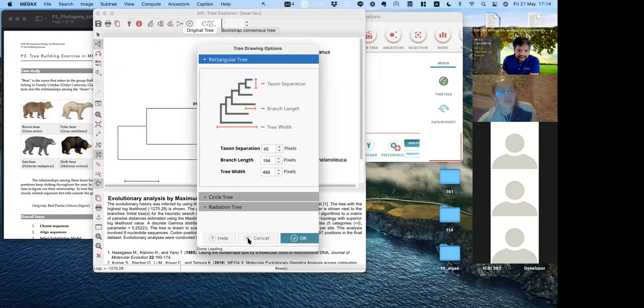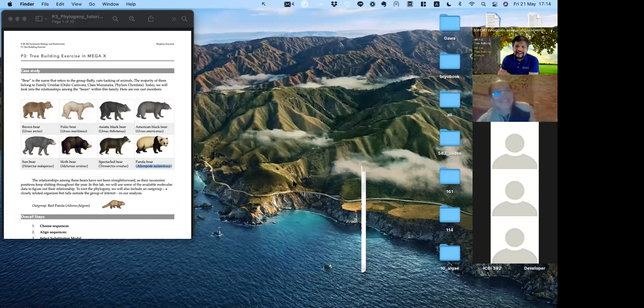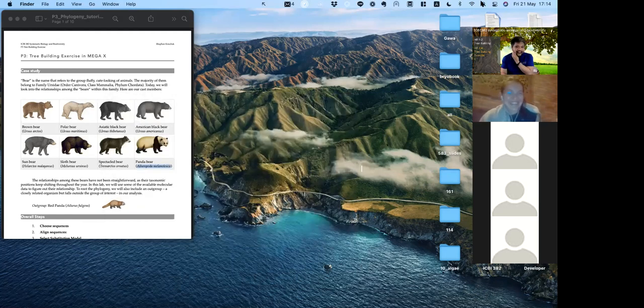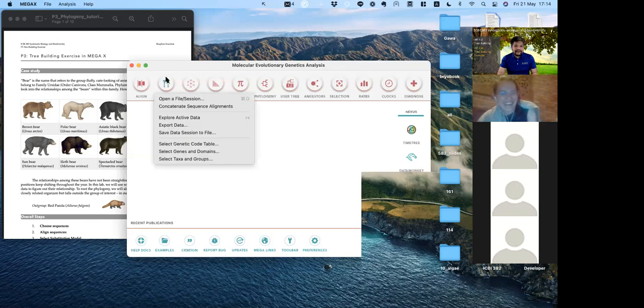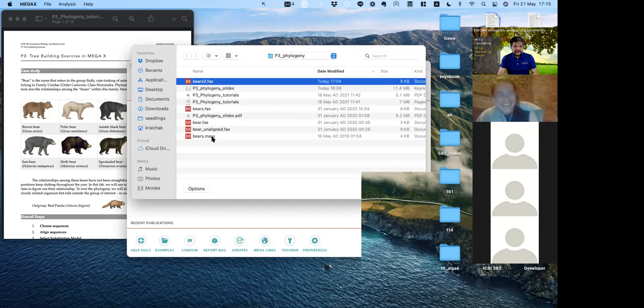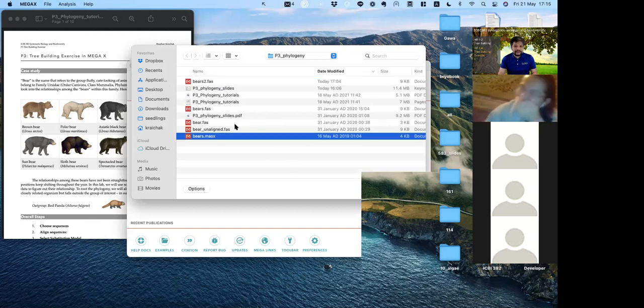I think my computer is fighting with me. Oh my God, the balloons of death is showing. Good God. No. There we go. This is a good demonstration. It crashed on me. Good God. All right, so I'm going to open this. Oh God, how I love this. All right, I have to do that step again. If you rewatch this video, this is going to be so embarrassing to the maximum point.